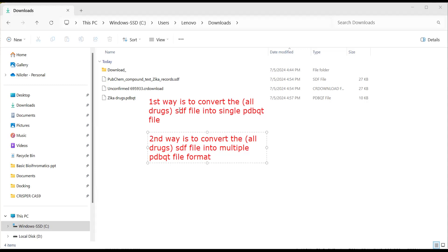So two things we can do: we can convert all the drugs into a single PDBQT file format as we saw — that is the single file with all drugs available. That is the first approach. Now, to verify this first approach is done correctly, you have to launch PyMOL on your system, which is the molecular viewer.